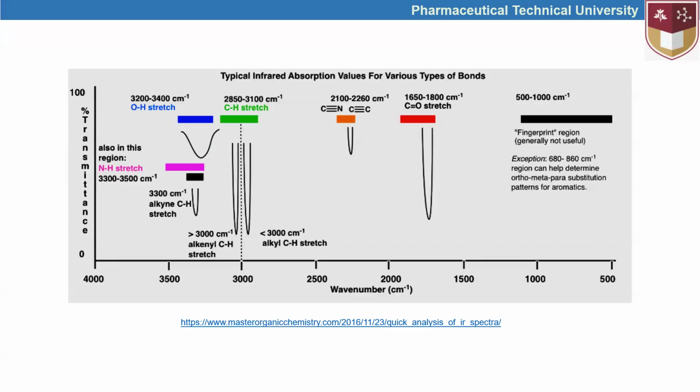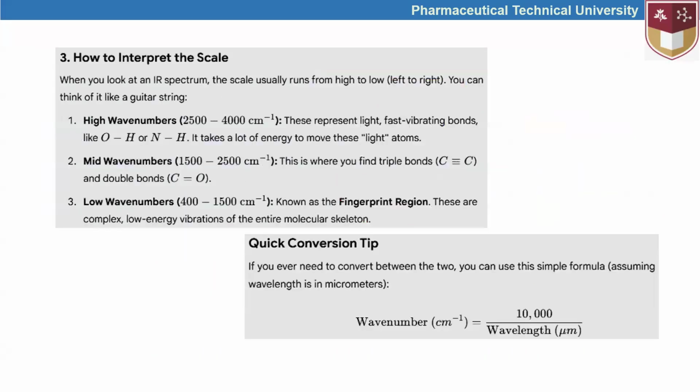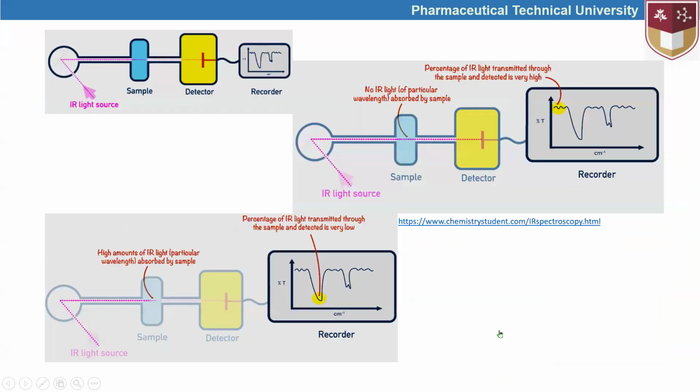In order to obtain some exact results, to claim the presence of some functional groups, we have to carry out a thorough comparative analysis of functional groups with those that were established in different compounds. That is why in this example we are reminded of the comparison of the sample with the reference compound's IR spectrum.